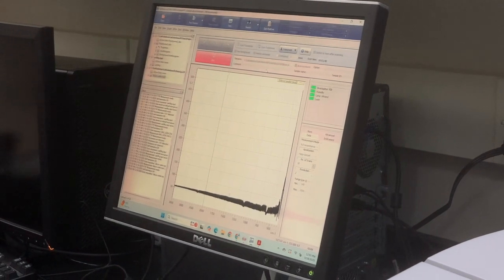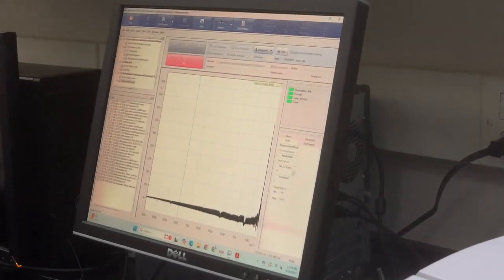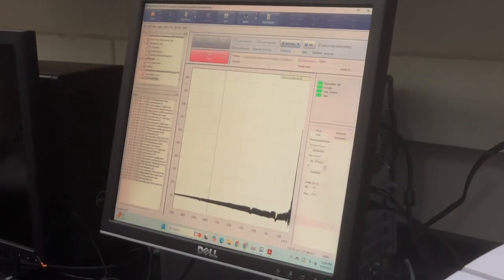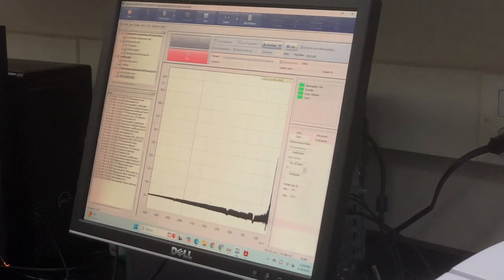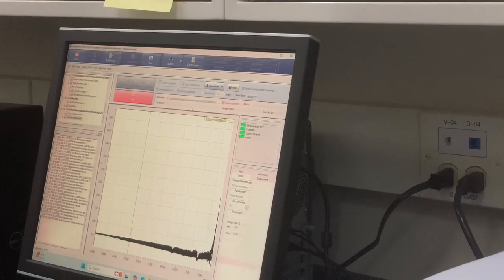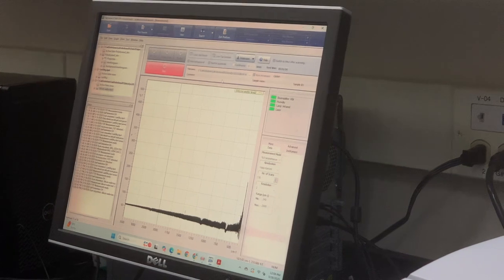As long as you have the auto increment checkbox checked, it'll add like 001 to the end of the file name, or 002 or 003. Automatic save files, yes, it's very helpful. You don't have to rename your files every time. I'm not surprised. I wasn't expecting this to look decent, just throwing that out there.